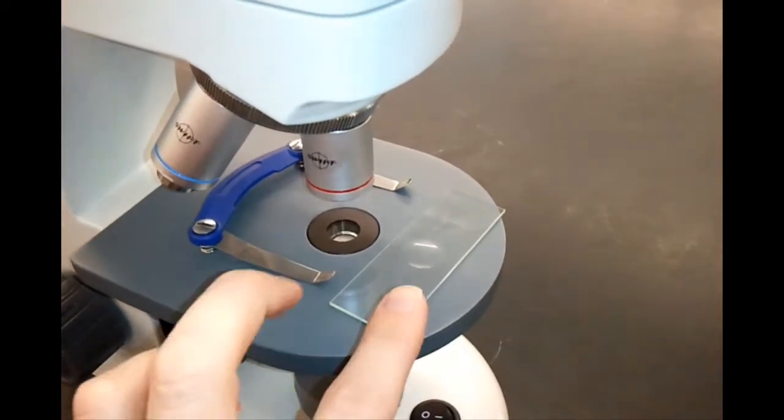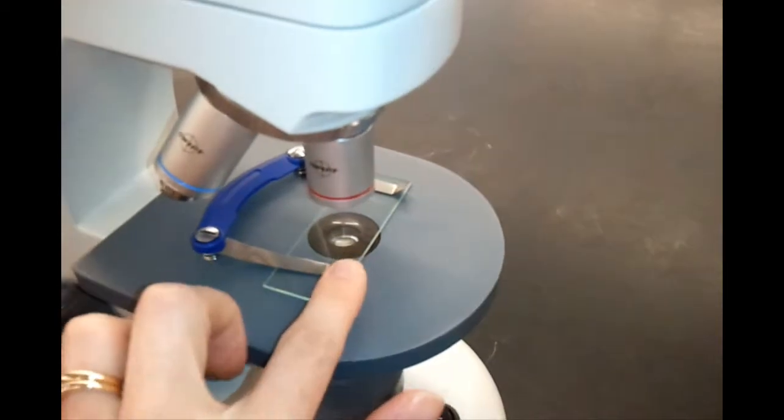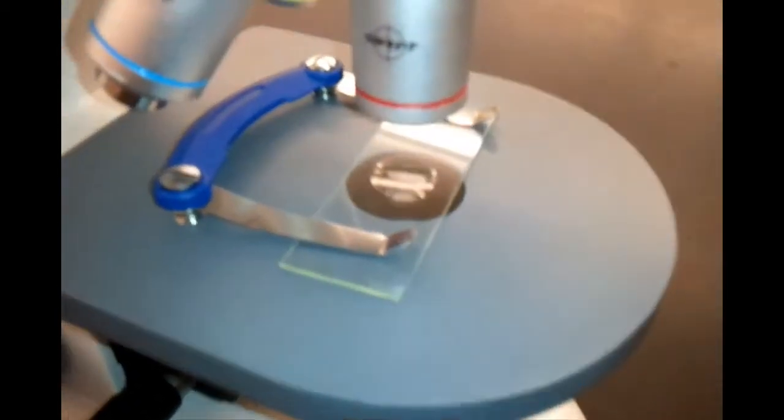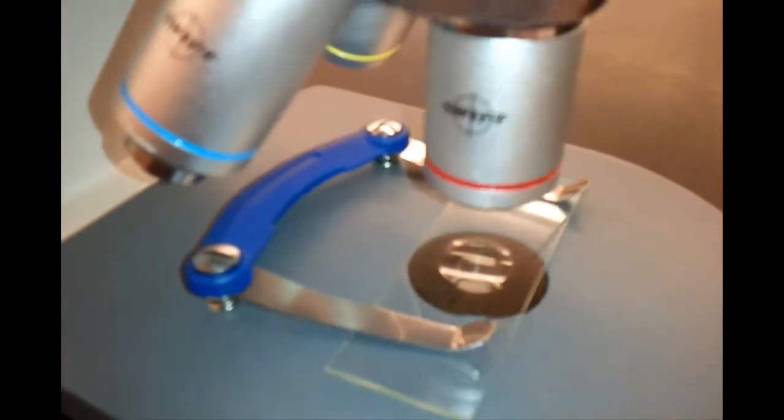The microscope stage holds slides for viewing. The stage clips hold the slide in place on the stage.